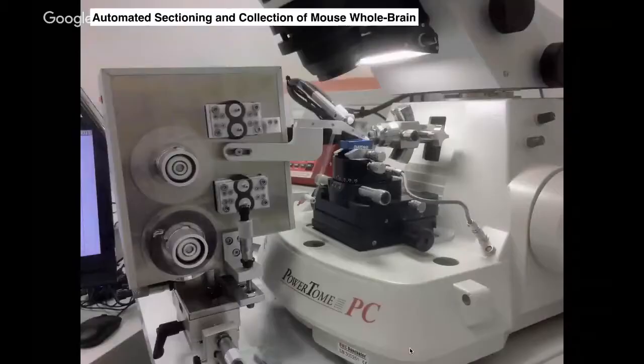And so I purchased one of these ATUMtome machines. So this ATUMtome, it's this box on the left-hand side. This was based on a design that Ken Hayworth developed some years back in Jeff Lichtman's group at Harvard. And they've been developing this technique extensively. And what it is, basically, is a conveyor belt for picking up sections that are produced automatically from a commercial ultramicrotome, which is shown on the right-hand side.